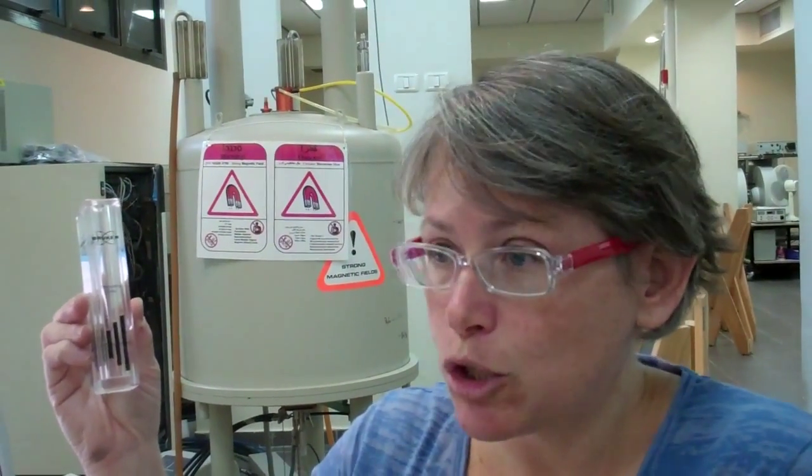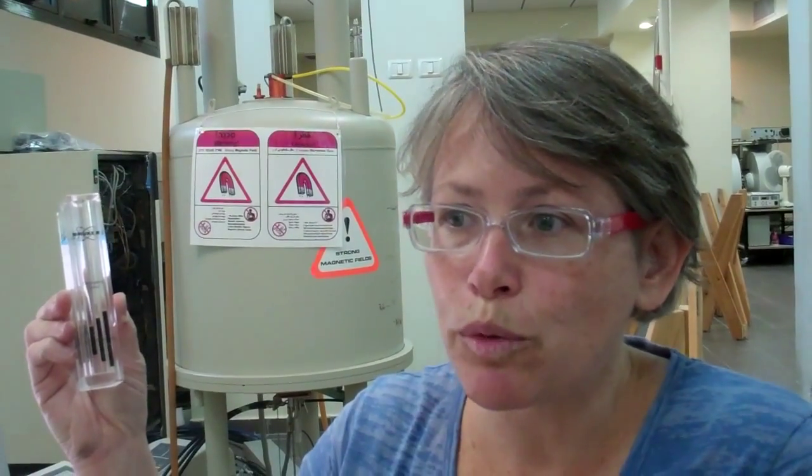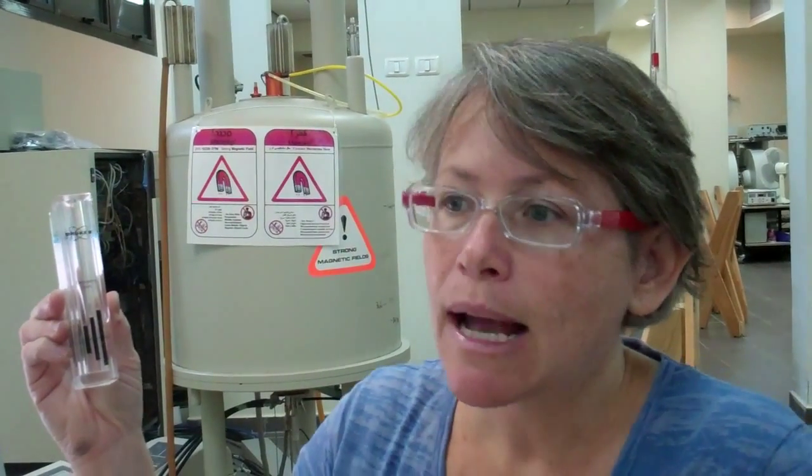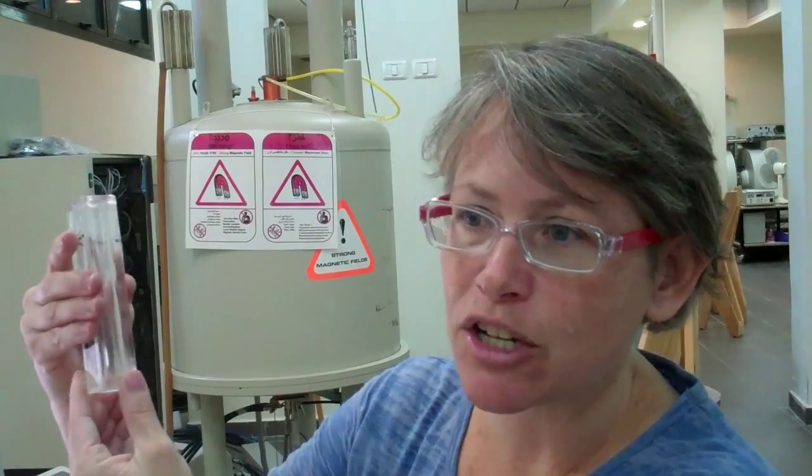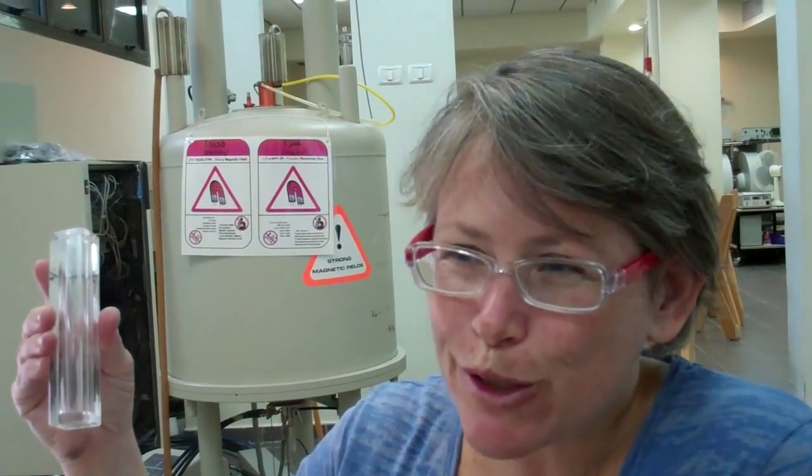We have a QMP probe inside this magnet. It has two coils, an outer coil doubly tuned to proton and deuterium, and an inner coil for the variable detection of carbon, phosphorus, or fluorine.